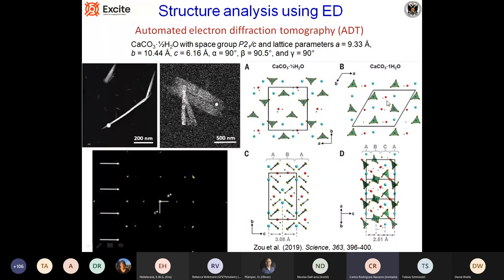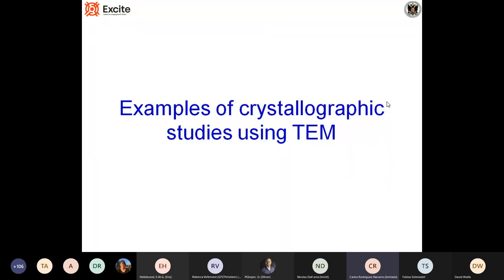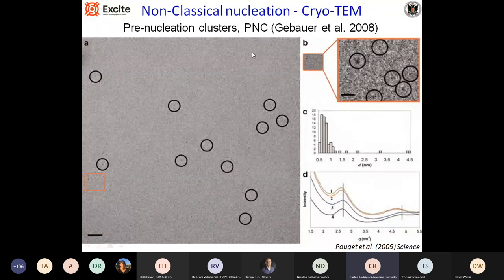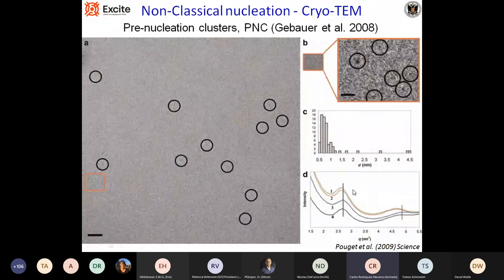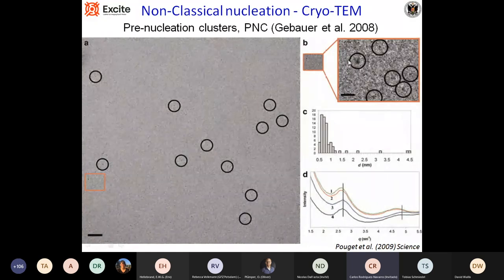Now for some quick examples of crystallographic studies of different materials. Starting with non-classical nucleation, a very hot topic nowadays: these are observations of what are called pre-nucleation clusters that precede the formation of calcium carbonate phases. These are supposedly identified using cryo-TEM — nanoparticles about one to two nanometers in size. This is controversial — some people believe they exist, others do not.